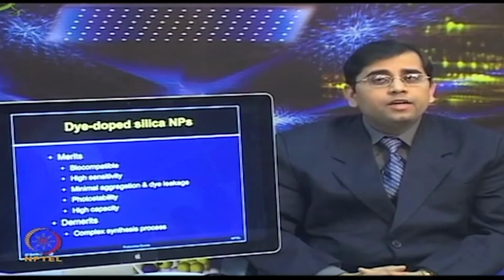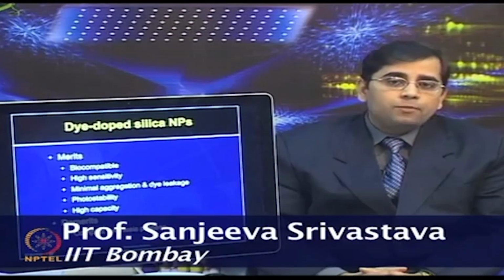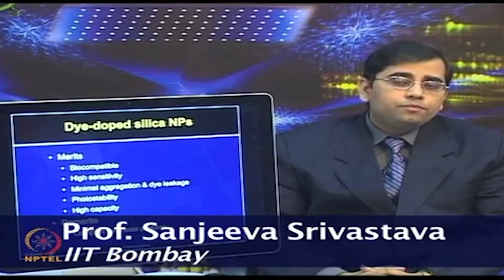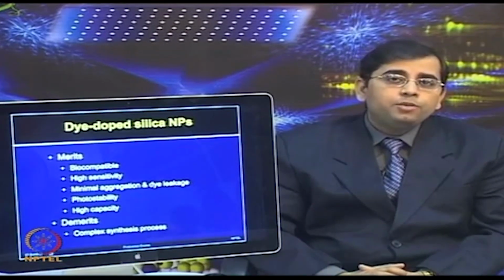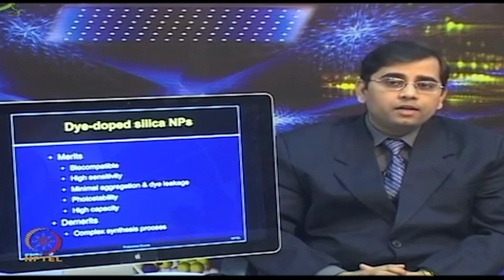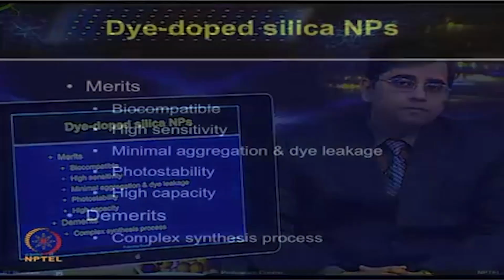The dye-doped silica nanoparticles have been used for a variety of biological problems. The application of various functionalized silica nanoparticles has been demonstrated in diverse fields such as biomarker discovery, drug delivery, and multiplex signaling in bioanalysis.